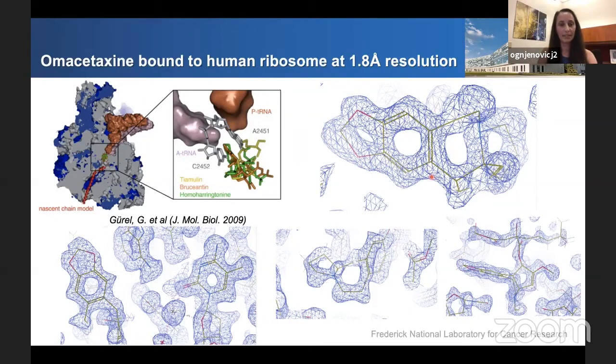When it comes to the binding site, the drug is obviously bound at the same spot as previously reported. However, we are seeing certain differences. Potassium ion, for example, is differently positioned than in Steitz's map, and there are several residue flips. So even though mechanistically it looks the same, chemistry and crucial interactions are actually different. We are even seeing different solvent positions in important parts of where the drug binds. Even though where the drug binds is not the best part of the map, the density for the drug really shows all the features nicely.